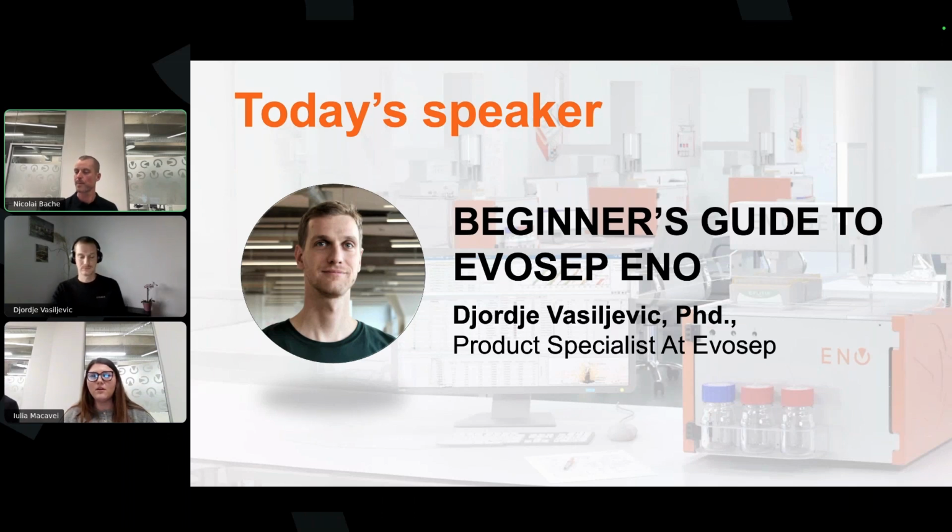Once you finished using your column, we just keep them. And these columns are, as Djordje said, the performance columns that we use on the Evosep Eno, and they are designed to last a very long time, so to accommodate a lot of injections.